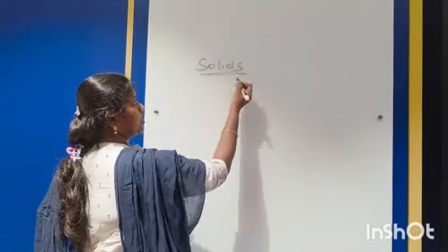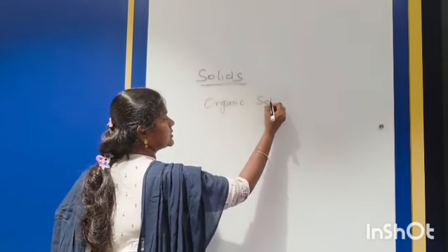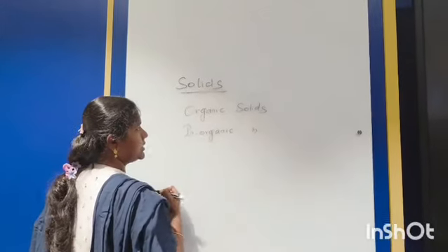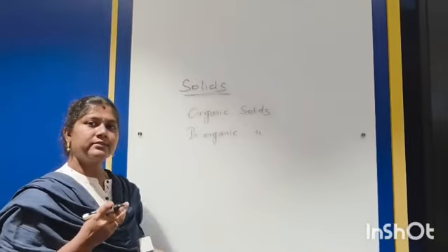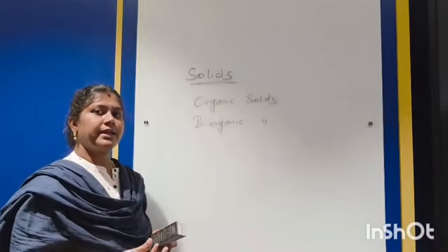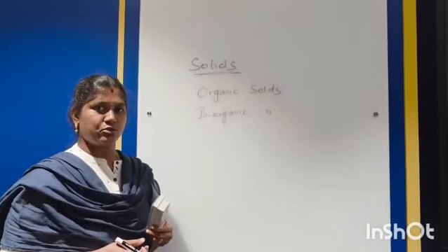In addition to the solids, we can determine the organic solids as well as inorganic solids. There is a separate category in the types of solids: organic and inorganic solids. The main difference is that here we take the crucible which was used for the determination of total solids. After getting the value of W2, the same crucible can be used in the determination of these organic and inorganic solids.